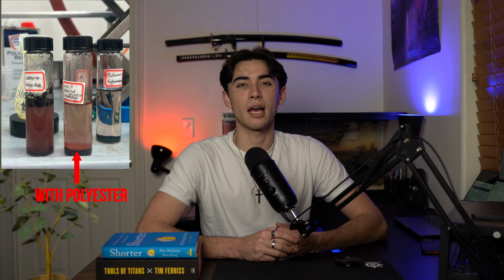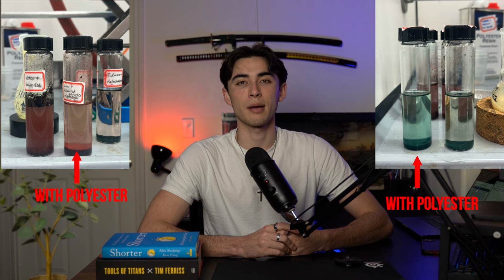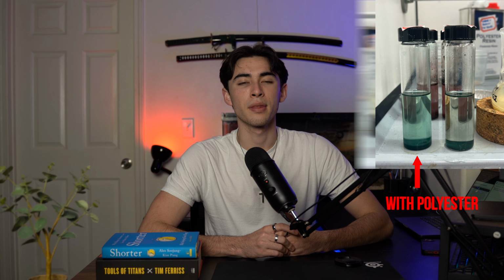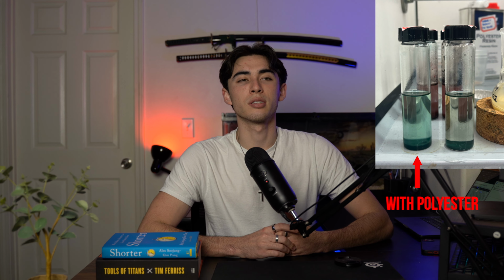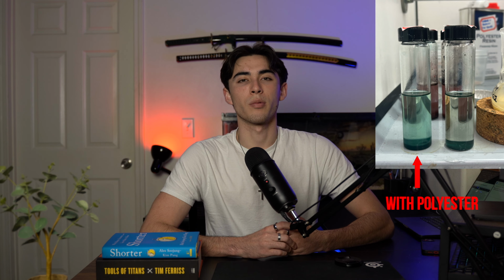As seen in the figure above, the polyester encapsulates the Sudan red dye while in the water medium. On the other hand, the polyester does a poor job of encapsulating the malachite green dye. When you compare the two solutions, the one without the polyester is much clearer than the one with the polyester. This demonstrates the invertible switchable micelles of the polymer.